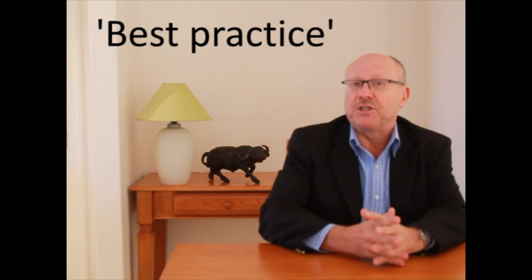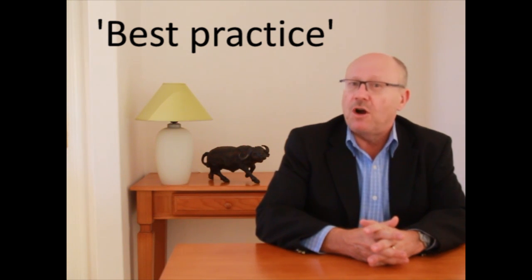Hopefully some clarity will be forthcoming in the next revision of the GHS Purple Book due out in 2013. In the meantime, principles of best practice should be followed, this often being the terminology used by competent authorities. This somewhat imprecise statement allows users to exercise their best efforts in order to achieve compliance.